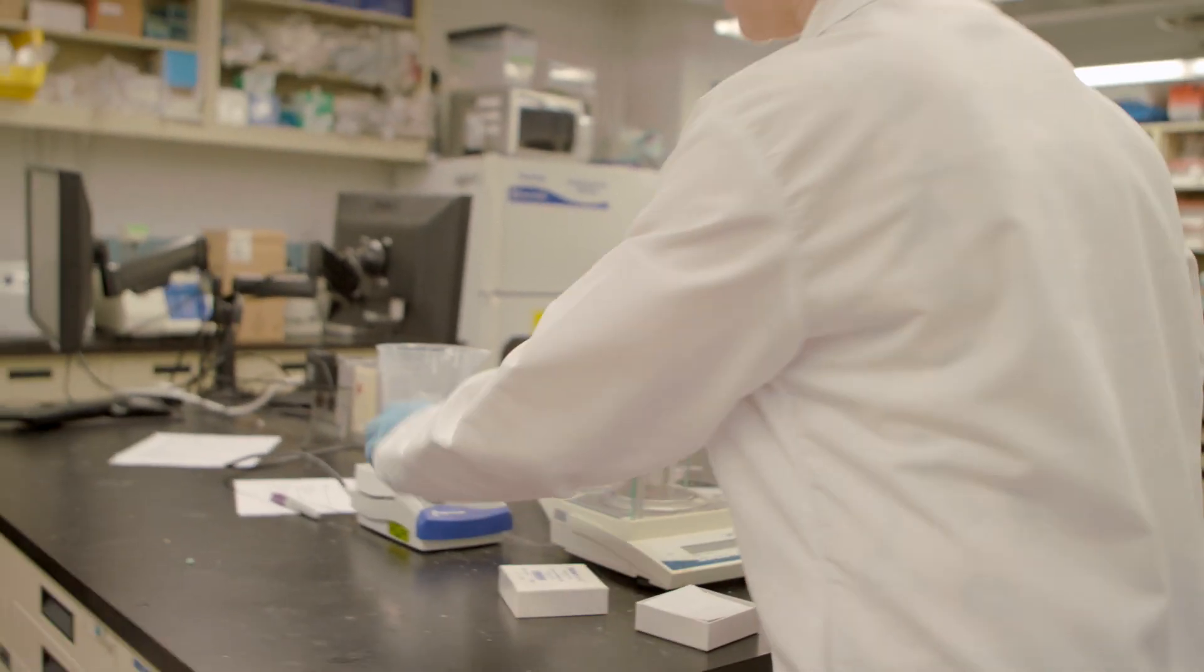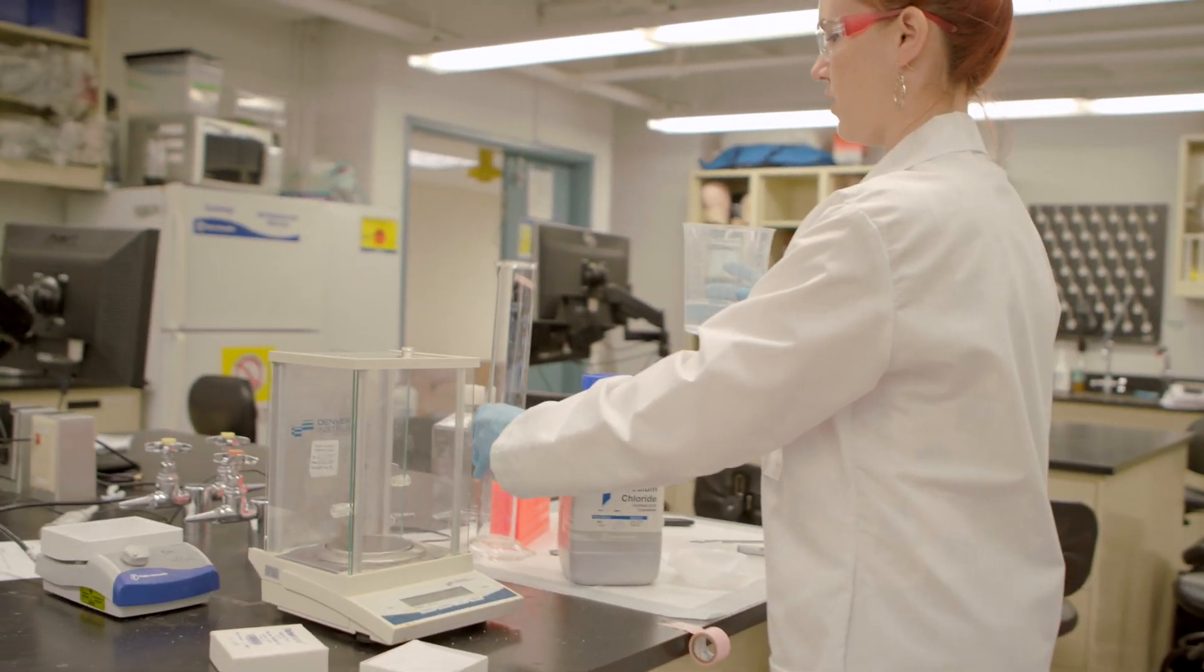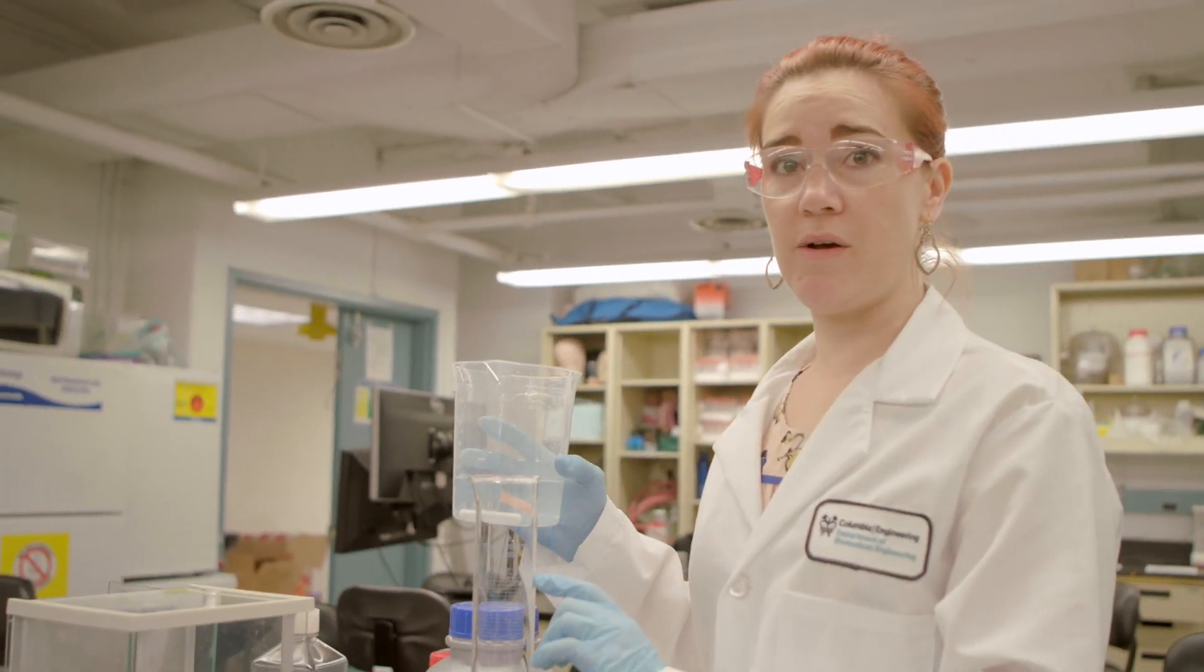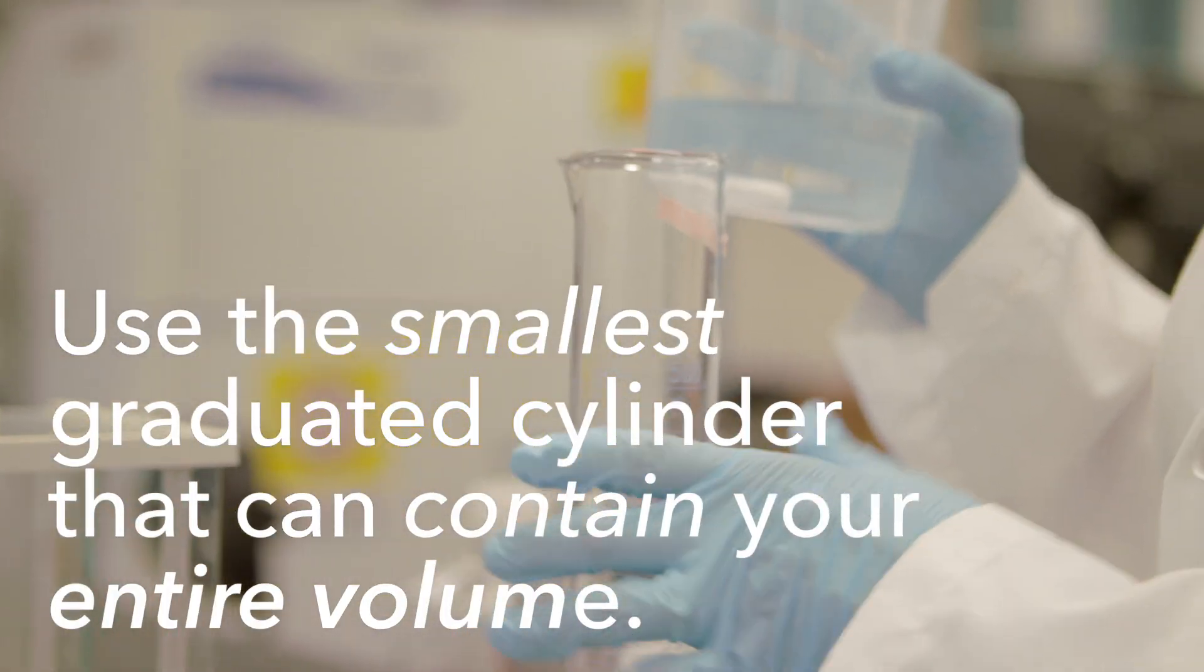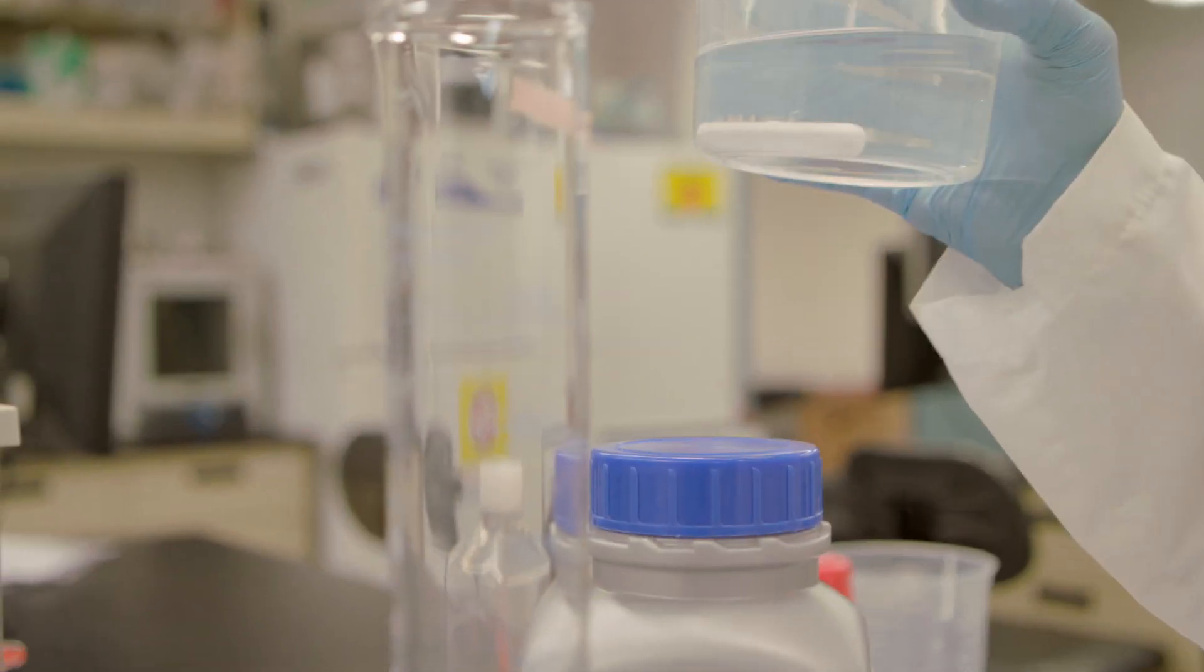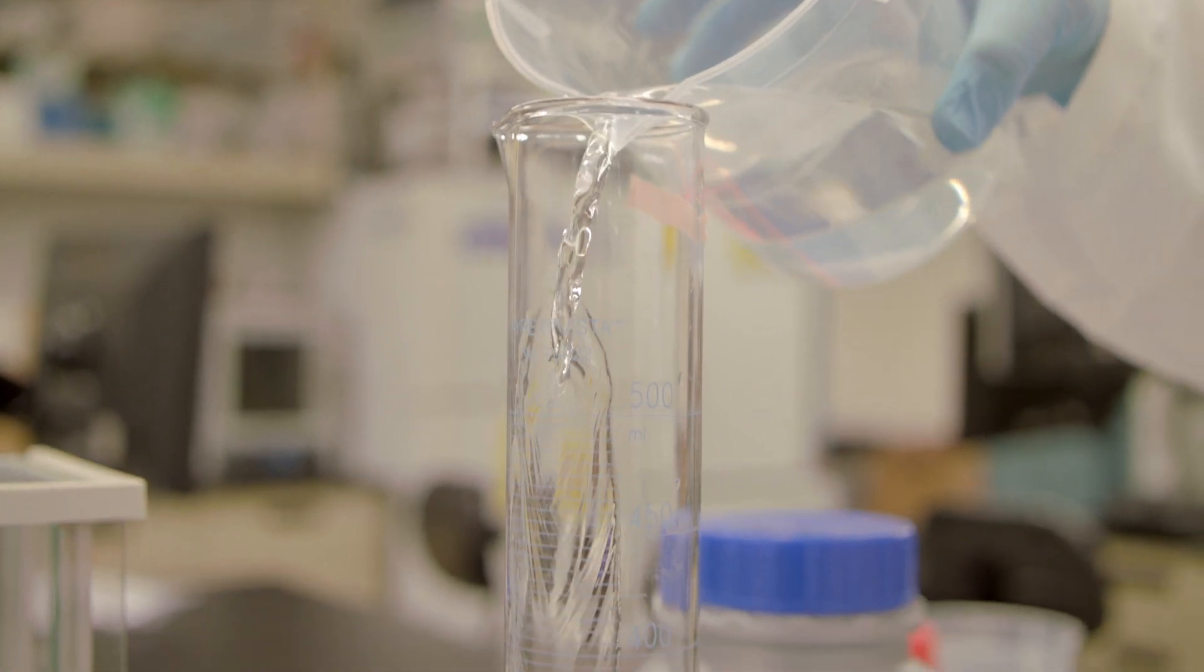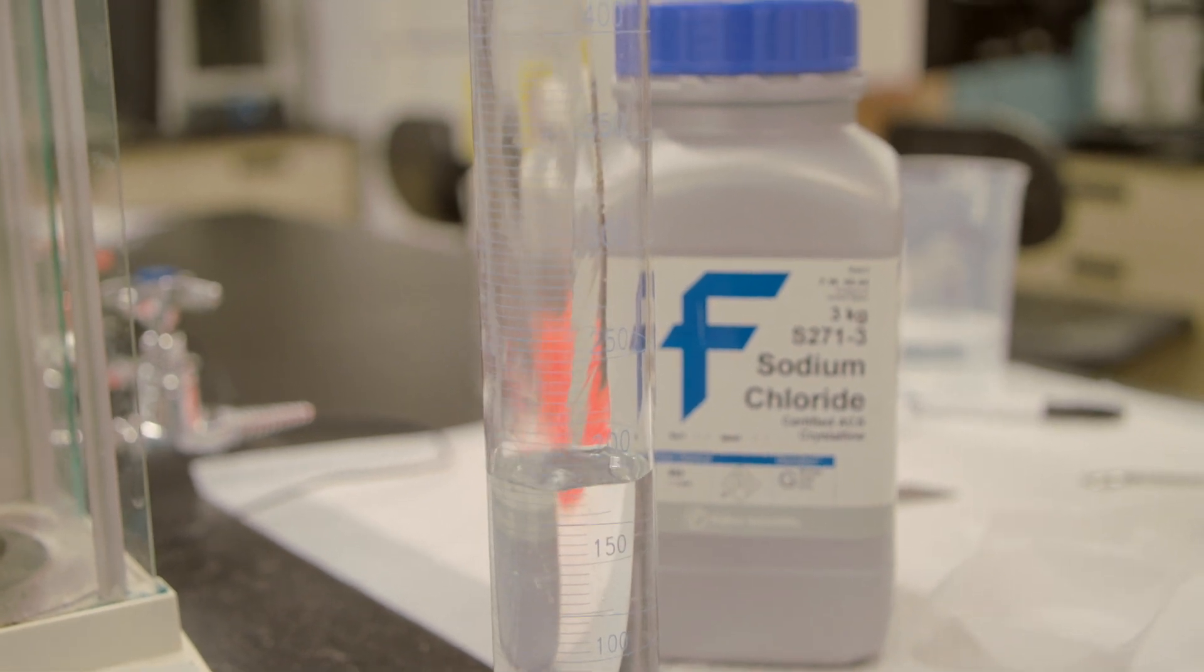So our liquid looks nice and clear. I'm going to turn this off and pour my liquid into a graduated cylinder. I know I want 500 mils in the end. You want to pick a graduated cylinder that's the smallest cylinder you can use, but still hold all of your volume. So I wouldn't want to use a 1,000 mils cylinder to measure out 100 mils of liquid. In this case, I have this nice 500 mils cylinder, and that's exactly what I want.